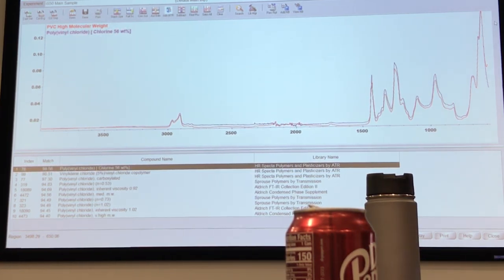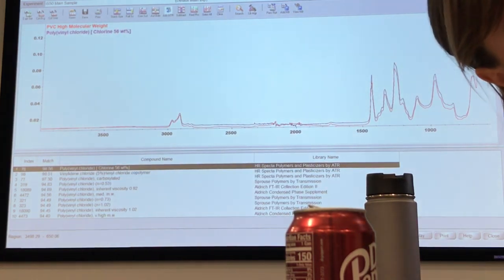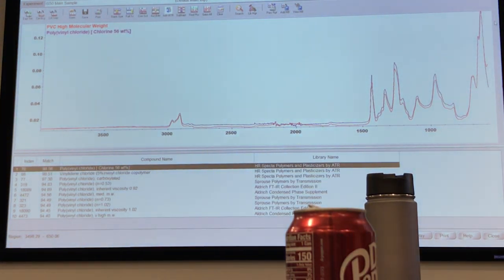Right. Part of our overall goal, I think all of us here, is this coming interest in much more extensive sampling. The best practice, which I totally get, is to take those fibers and squish them before you measure. It would be interesting to measure the fibers before you squish them, and then squish them, because eventually we might hopefully get to the point where people don't have to do the squishing and can increase throughput. So I was curious if people are doing all those different permutations, or if labs are focusing on just ATR. Like fibers, reflectance, yes, great.